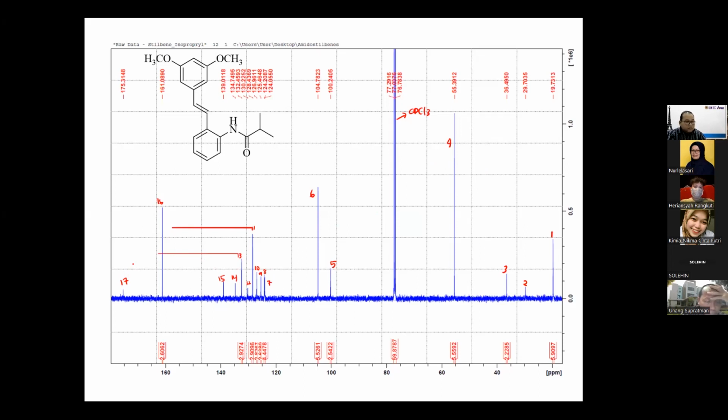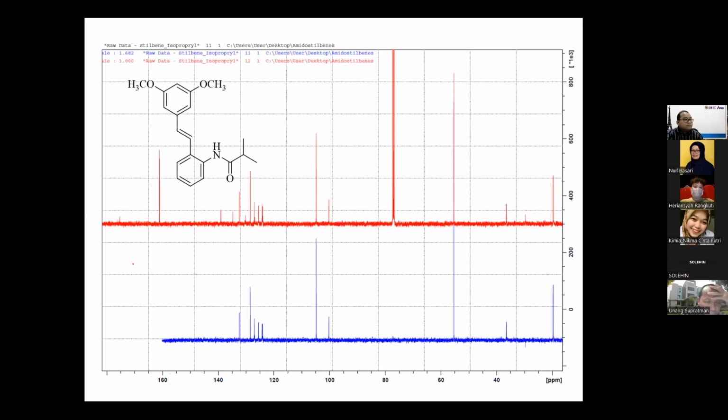Okay, so the second thing you have to do is analyze your DEPT. Open your DEPT. Again, numbering again.